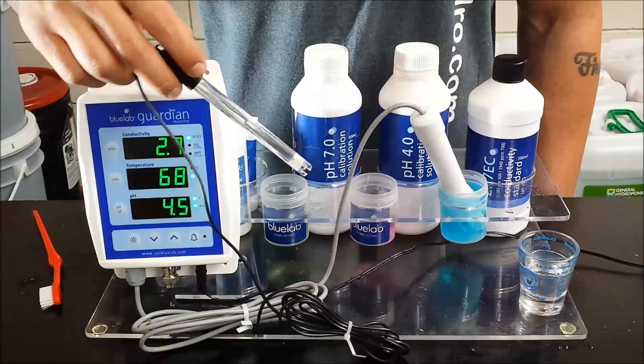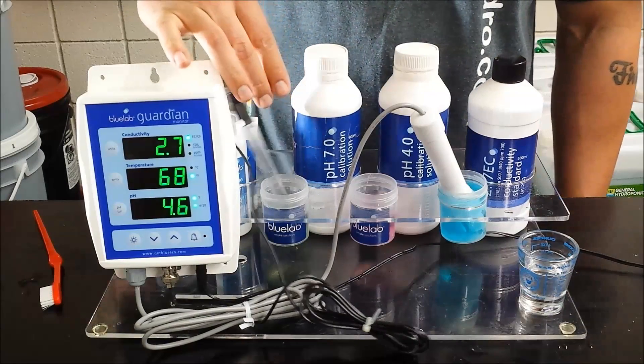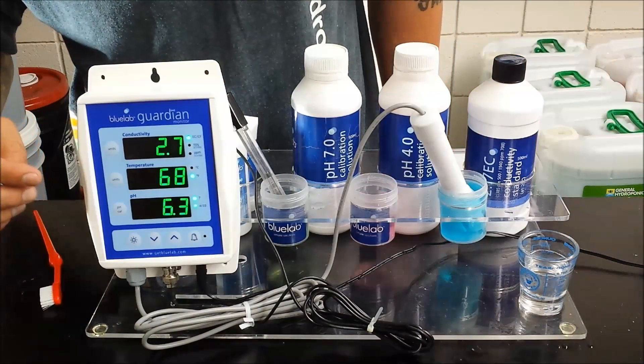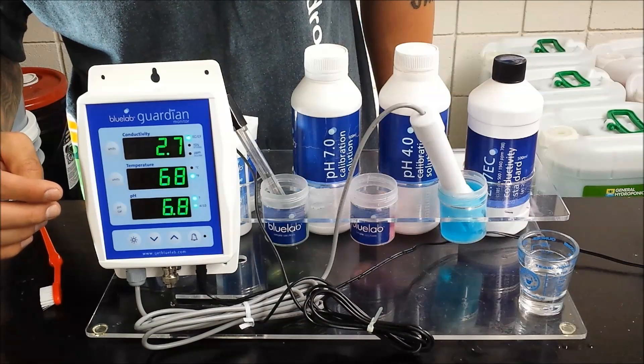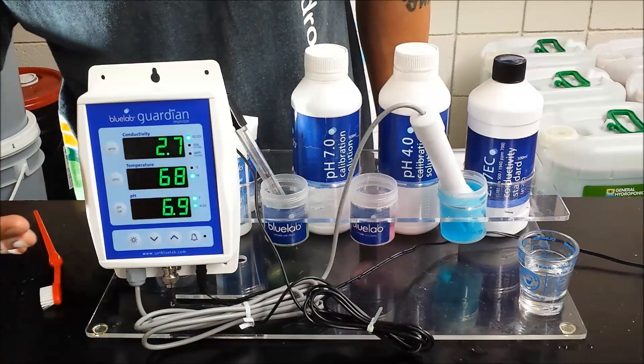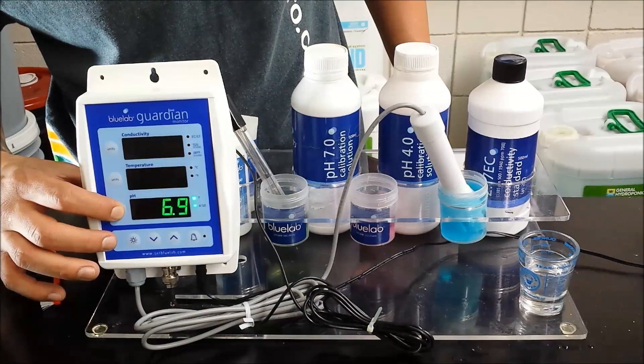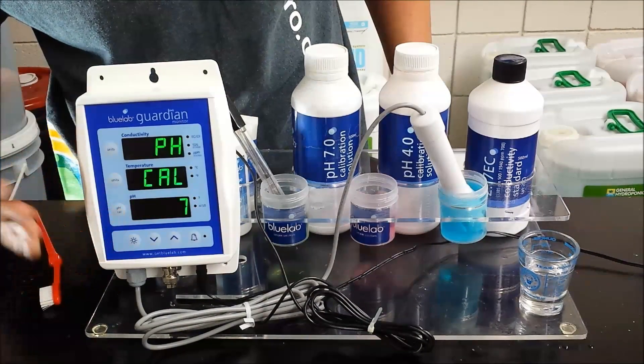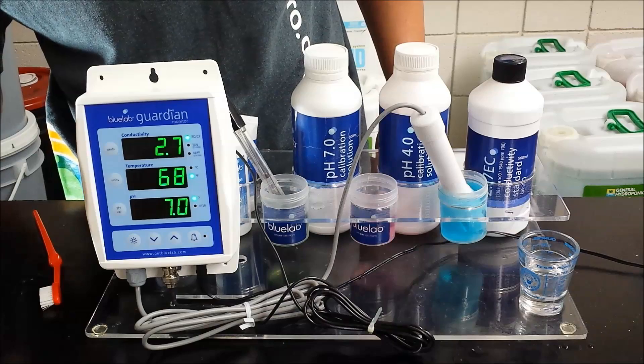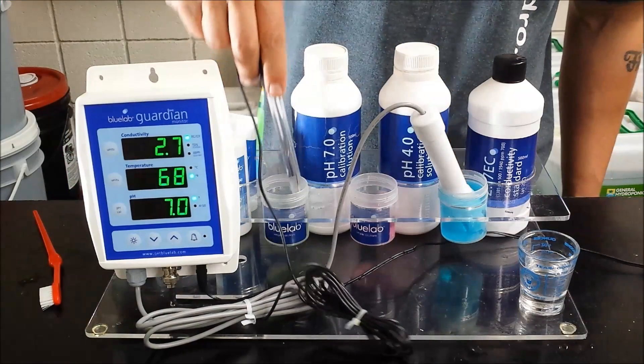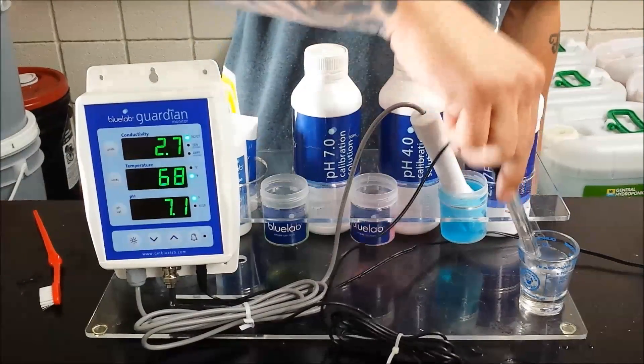So we're going to go ahead and put it in the 7.0 first. Once it settles on a reading go ahead and hold down the pH Cal button until it says pH Cal and it locks on the 7 for you. Take it out, rinse in some water.